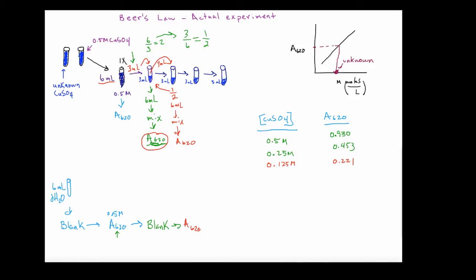We keep repeating this process. I move another 3 milliliters — it's going to be one half the concentration of the previous tube. We'll have 6 milliliters, mix it well by capping the top. We blank the instrument a couple of times and get another A620. My new concentration is 0.0625 molar, and my new absorbance is 0.116.